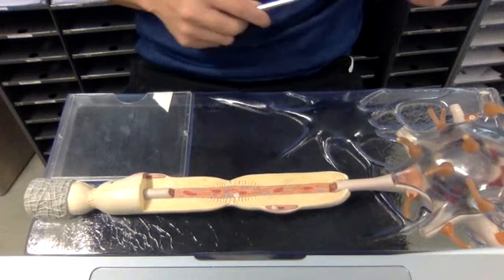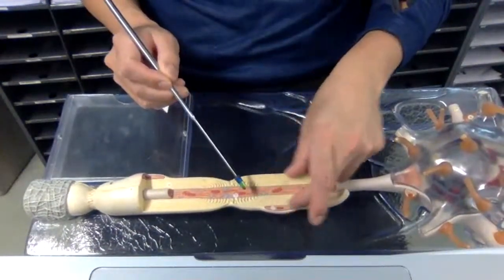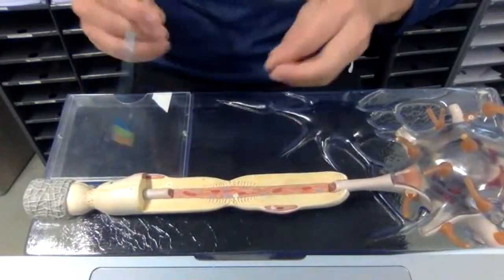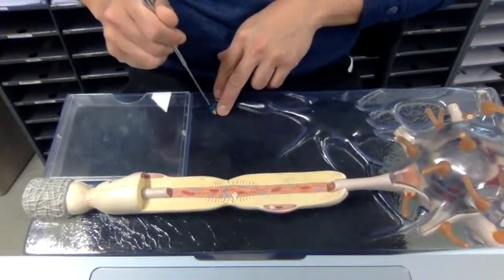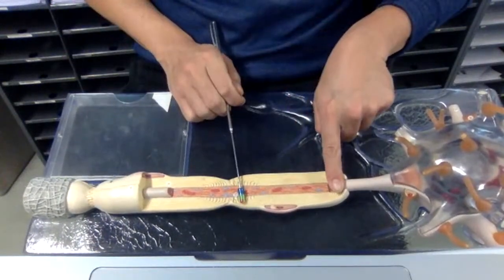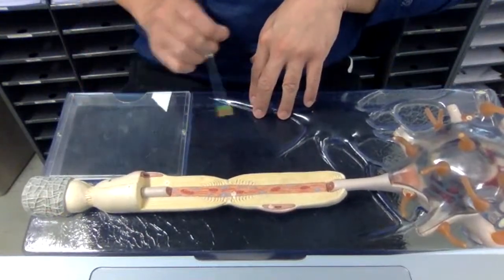That's right, Schwann cells. These are Schwann cells because these are individual cells wrapping around. If it was an oligodendrocyte, the cell body would be out here and it would send out a projection that would then wrap around. But these are individual cells wrapping around with gaps in between.